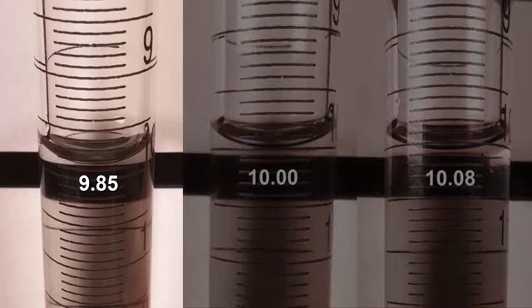In the first example, the meniscus is below eye level and the apparent volume is 9.85. Notice how you can see the entire encircling ring from the 10.00 milliliter mark.